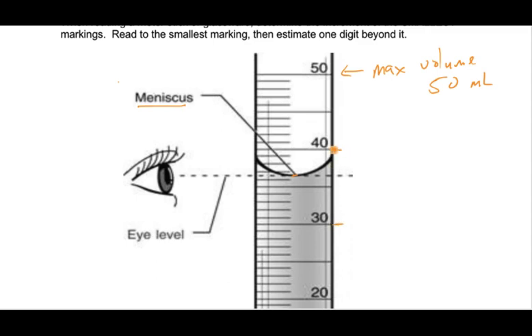For reading these different marks, you've got to interpret them correctly. The big lines go up in 5 milliliter increments, and the smaller lines go up in 1 milliliter increments. You can see 35, 36, 37, 38, 39, and then 40. Our meniscus is falling somewhere in between two of these lines.